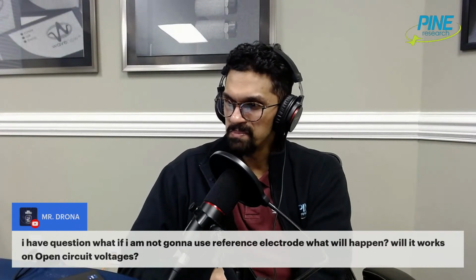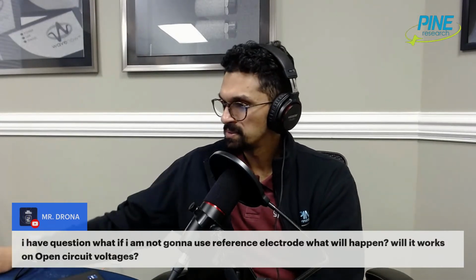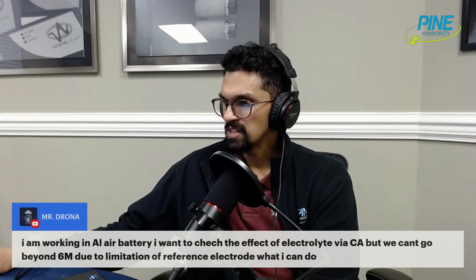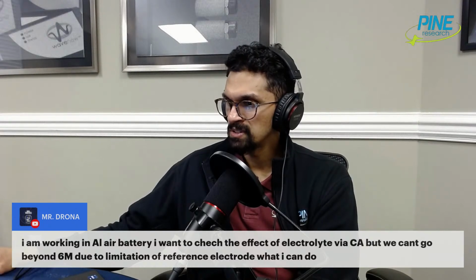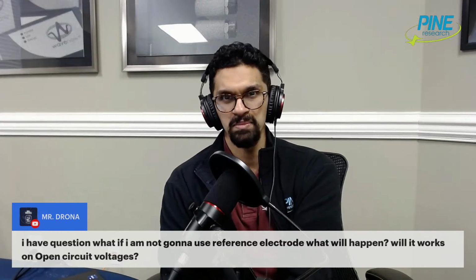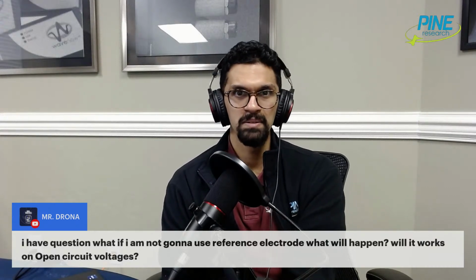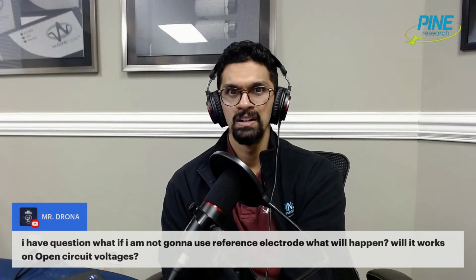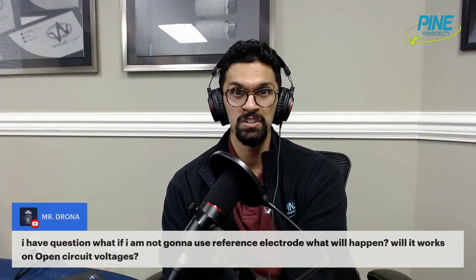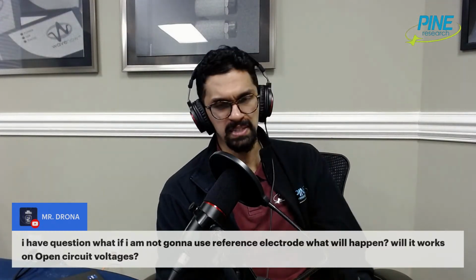So I would need to know a little bit more about your system, like what exactly you are trying to do. Okay, yeah, so you're trying to do chronoamperometry. So check the electrolyte via chronoamp. So chronoamperometry, you typically apply some kind of potential and then you make a measurement. So when you mentioned having a reference electrode, I imagined you were setting a potential, and then you were measuring the current response as a function of time. But that may or may not be the case.